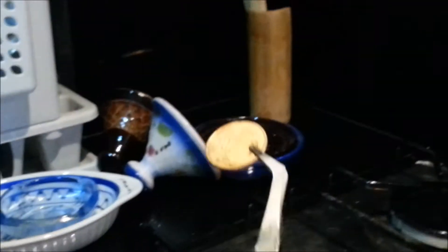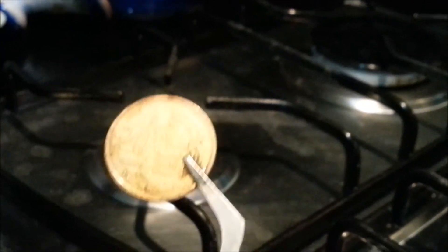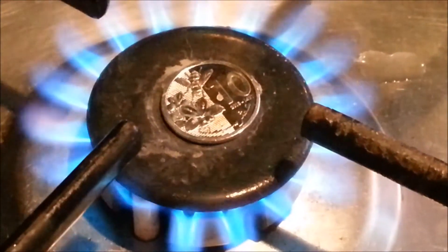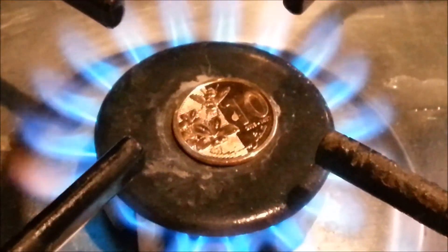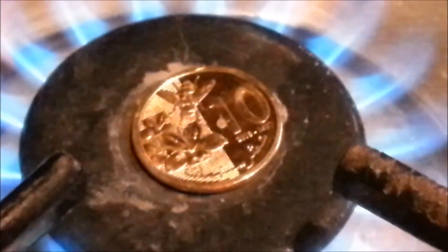The zinc is boiling and starts mixing with the copper. We get a yellow color, but we have to be careful not to heat it too much. We do it again, being more careful this time, and we can see the silver metallic color turn into a golden one.